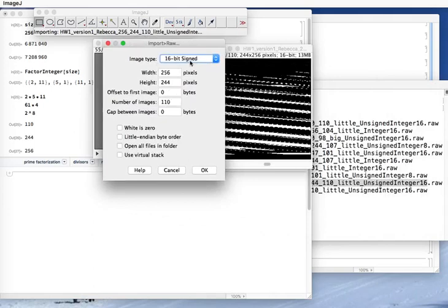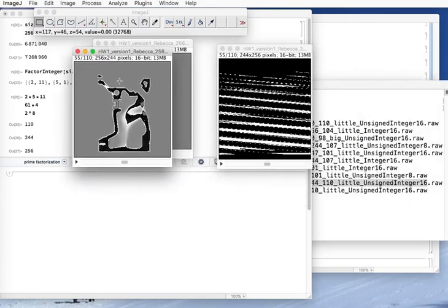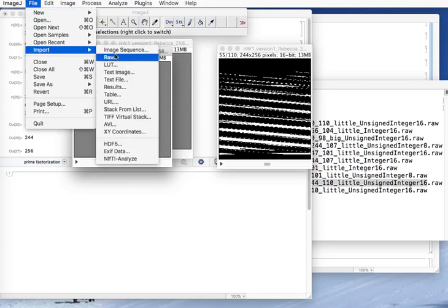It's either we're off here or we're off here. Let's see if this will fix it. Not so good. Now it could be both of them.